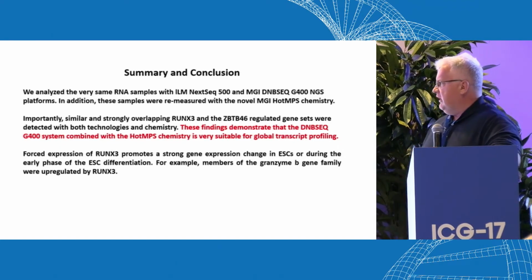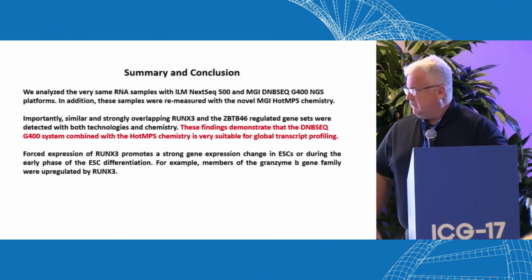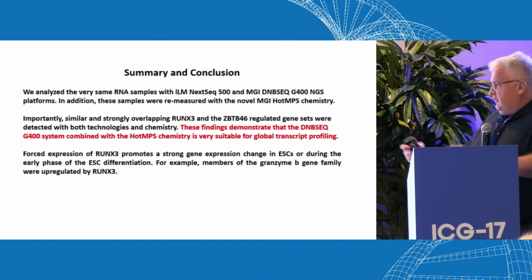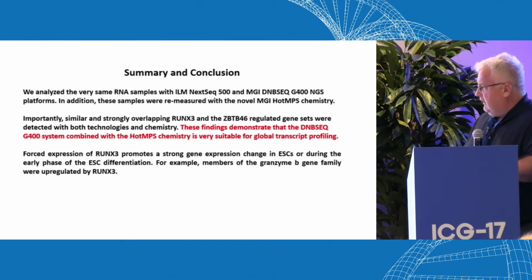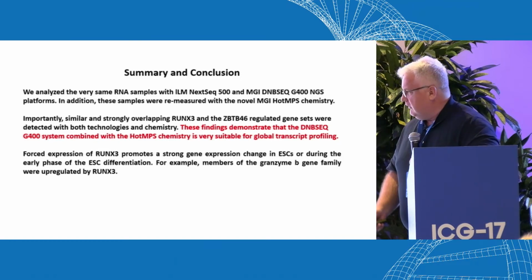So these results demonstrate that the DNBSEQ system combined with the hot MPS is suitable for global messenger RNA transcript analysis. And we also identified some potentially novel Runx3 regulated genes, like the granzymes.